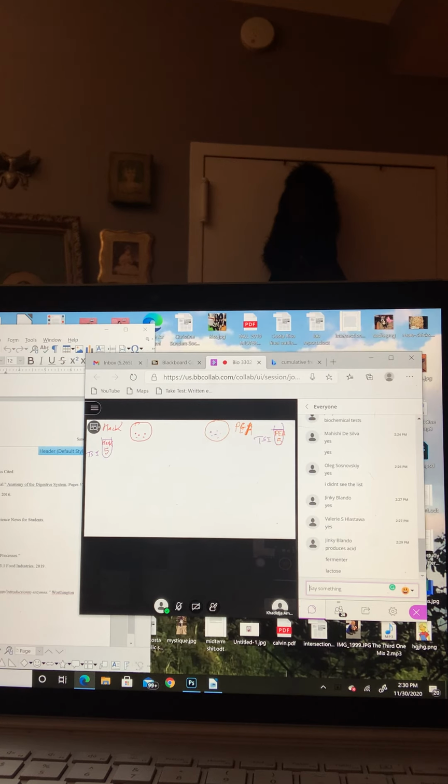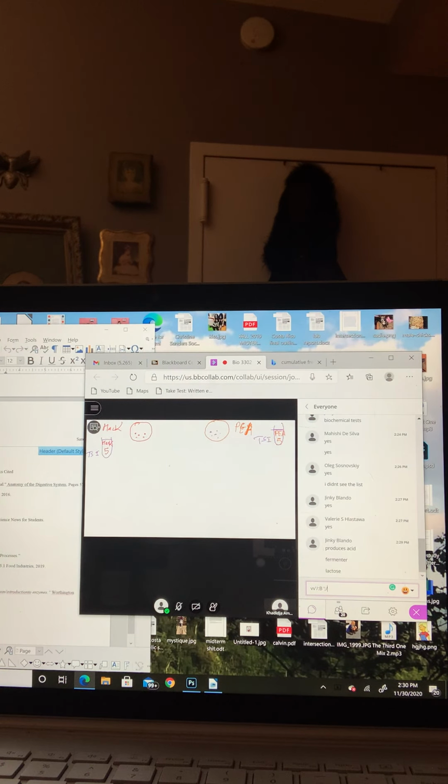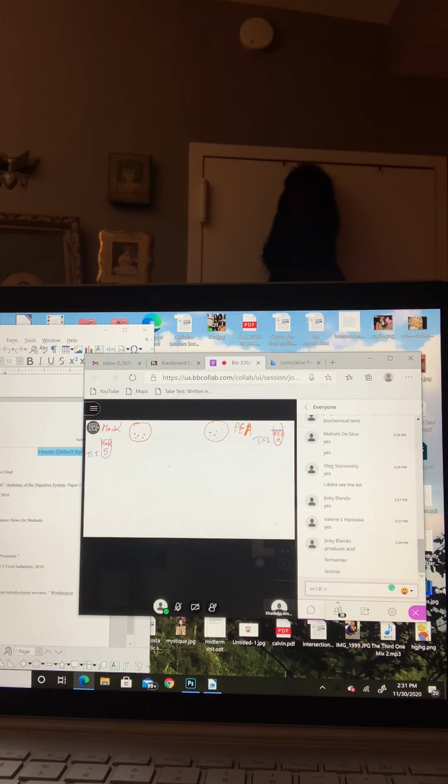Okay, so here, that's what I said, you have to get two sets. We talked about one, and you have to know that you have to do two biochemical tests from each plate. Guys, just let me know if you understand this, because you will need a set of the same media. Any questions, please?